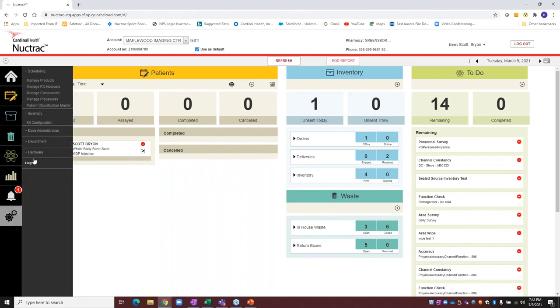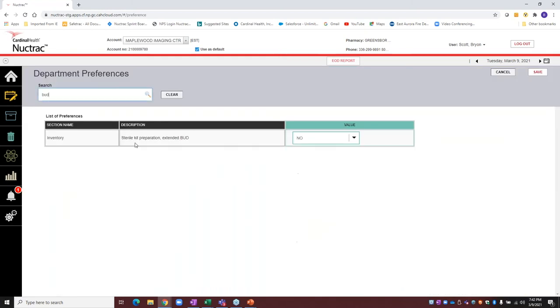So some of the items that we hit: RAM package receipt. I've already received the package into the system, so we already have that. I have my electronic data of it. I can actually go look at it and see what was received in it. And then of course my incoming DOT report with that.